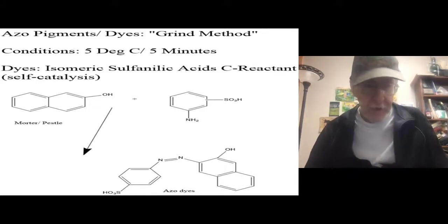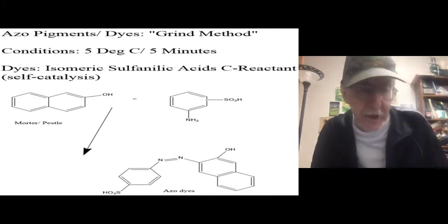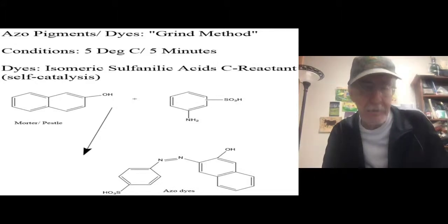You put equal molar amounts in a mortar and pestle and grind for 5 minutes, and you will see a color development rapidly. It's a marvelous process and a wonderful experiment in beginning organic for students. And it can be scaled up.